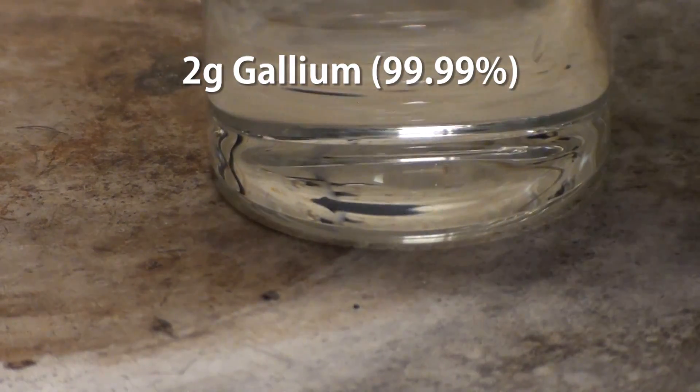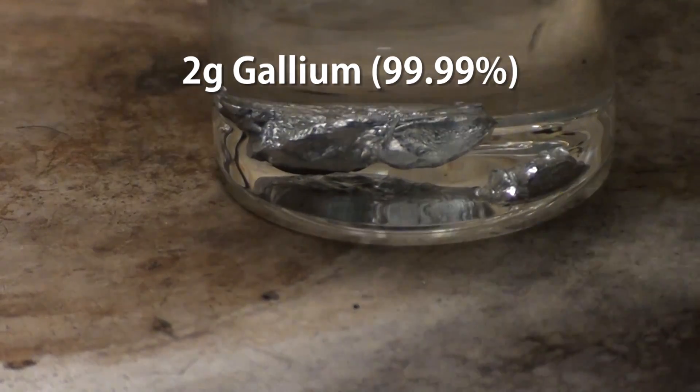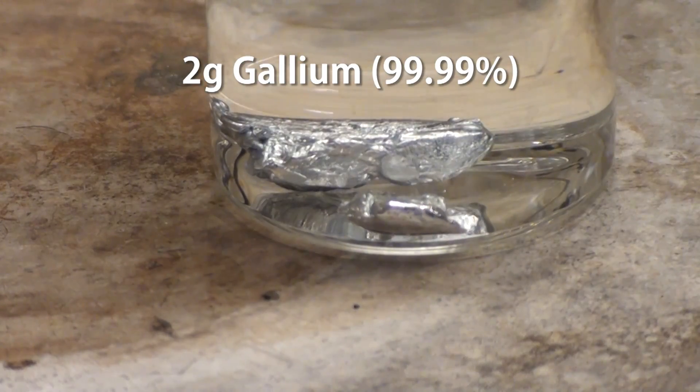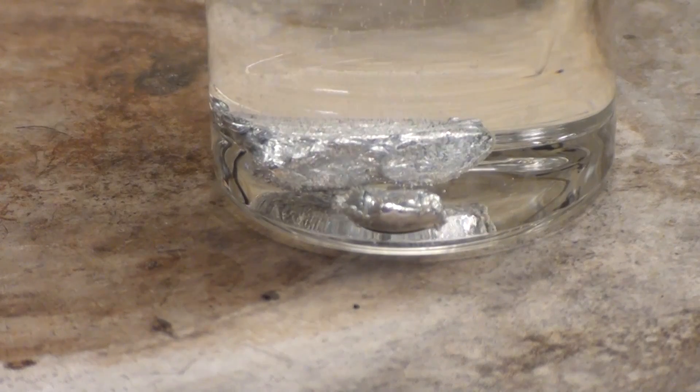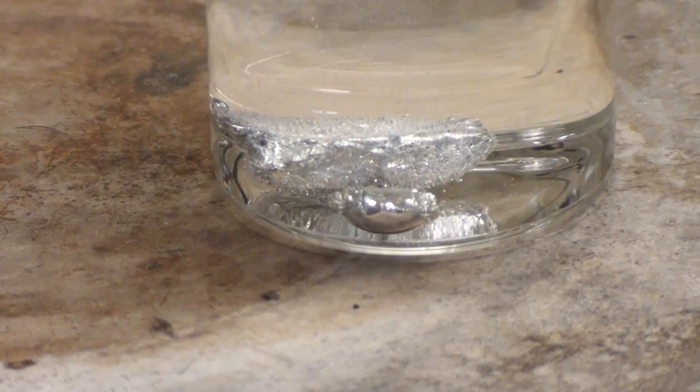Now we put in about 2g of pure solid gallium metal and heat the solution to about 50 degrees celsius. Don't use too much gallium or it'll be too heavy and flat out completely on its own, ruining the experiment.